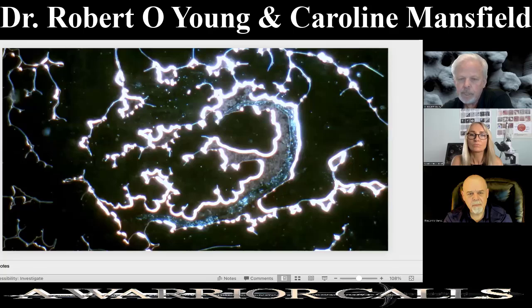But these proteins are normal when the blood is drying. It's a coagulation process the body goes into. They're called fibrin monomers.